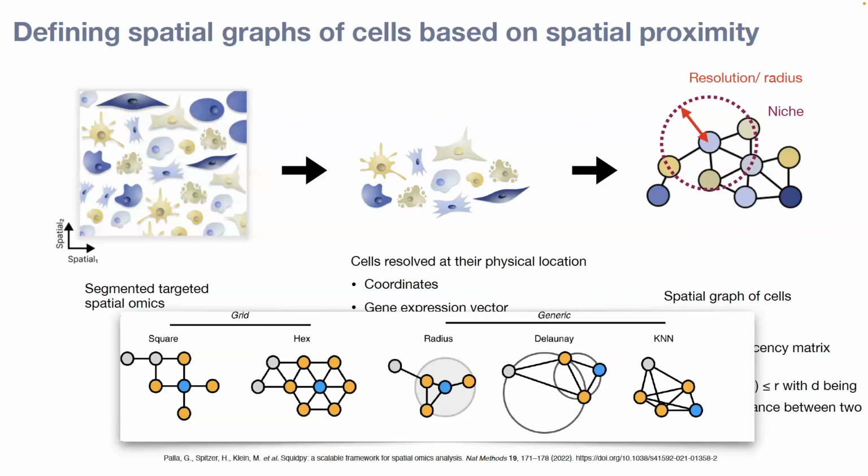However, there are still use cases where you see both ways of graphs being used equivalently. It depends a bit, as we saw throughout the last days, on your use case, ideally. But this is now how graphs are leveraged. And in my opinion, it's an easier representation of a graph compared to KNN in single-cell RNA-seq, because you can see it, you know what's going on. You can also visualize it, as you will be doing in the practical, how picking a radius and a graph structure can change your underlying assumption. It's the foundation for anything that's now building up on the niche label.